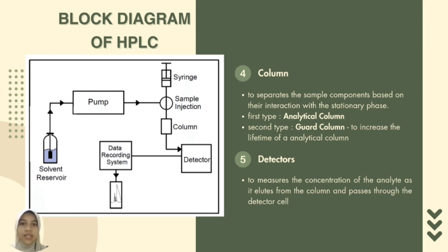And the last one is detectors. The function of detectors is to measure the concentration of the analyte as it emerges from the column and passes through the detector cell.